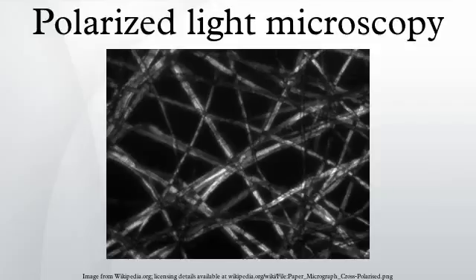The Michel-Levy chart arises when polarized white light is passed through a birefringent sample. If the sample is of uniform thickness, then only one specific wavelength will meet the above condition described above, and be perpendicular to the direction of the analyzer. This means that instead of polychromatic light being viewed at the analyzer, one specific wavelength will have been removed.